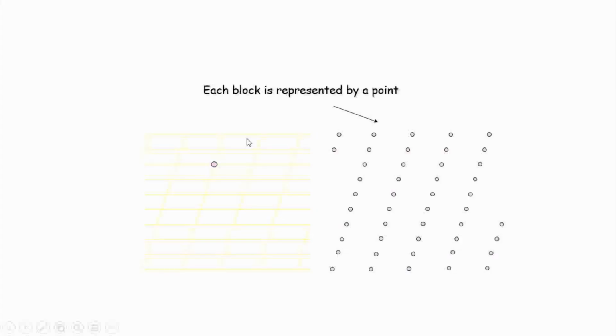So if you place one, or if you know one, so I'm just taking out one point or each block, and if I understand this particular block, I can repeat it with other blocks, right? Okay, so I have to understand or start with one small unit, and then I can repeat it with other blocks, and I will get an array of points, which is basically a lattice. So this is basically a lattice. So it was first a single spot, a single junction or a molecule I studied, and on this I went to the entire array of these junctions, or basically for this take as points, and once I complete this array of points, it will give me the lattice structure.